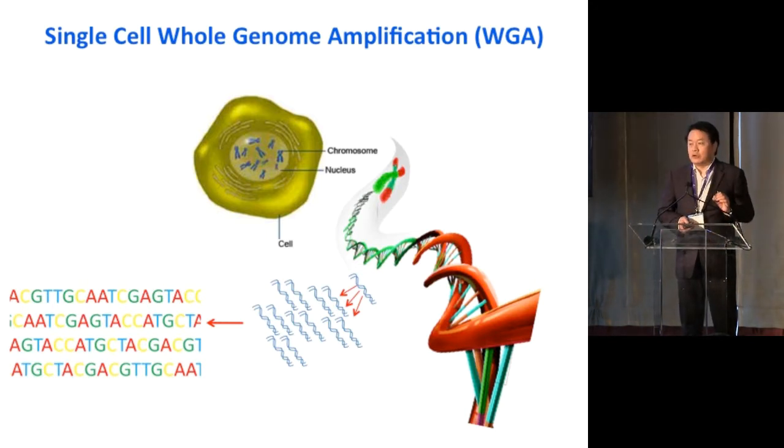So I will tell you our latest method for WGA today, and then present two applications to PGD and PGS. The first one being how to avoid any mistakes in PGD, PGS in terms of sequencing. And the second being how to do this in a non-invasive way.